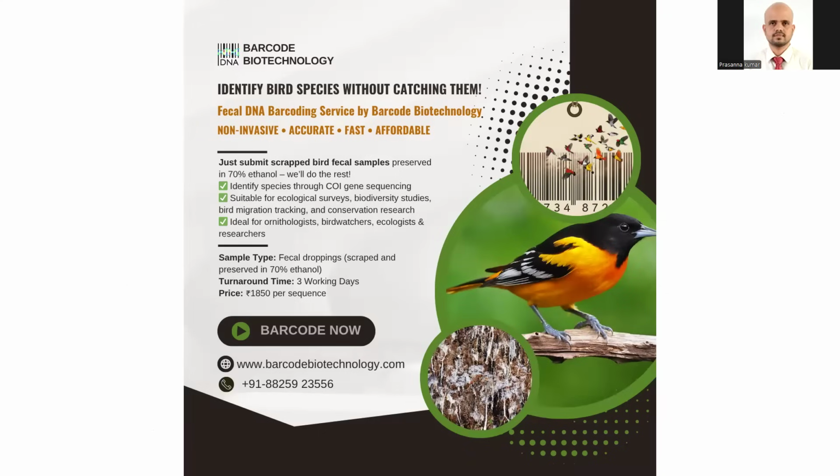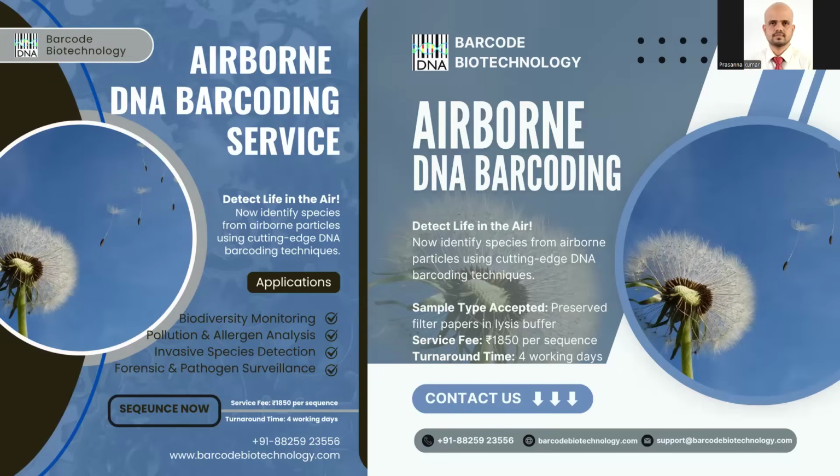Even for birds or other animals that you cannot catch for sampling, their dried fecal material can be used to decode what species it is. Very much possible. Even simply collecting air samples through a filter membrane, we can extract DNA from the membrane and decode the entire biodiversity collected in the air.